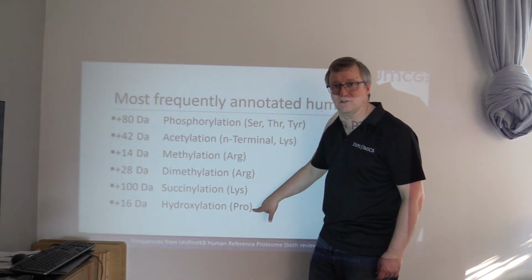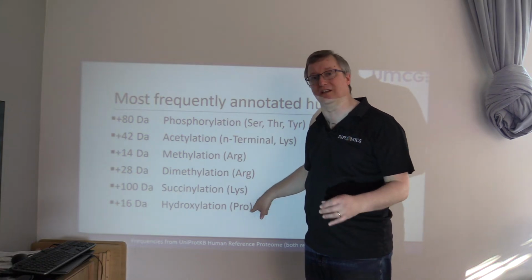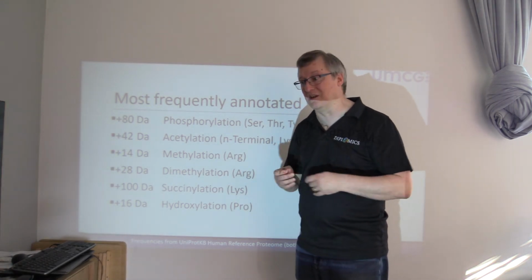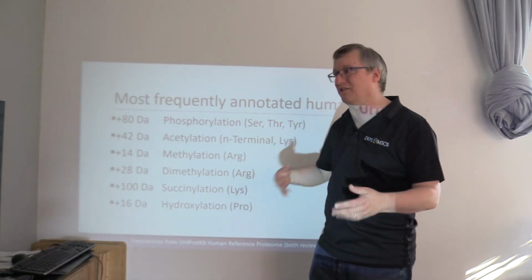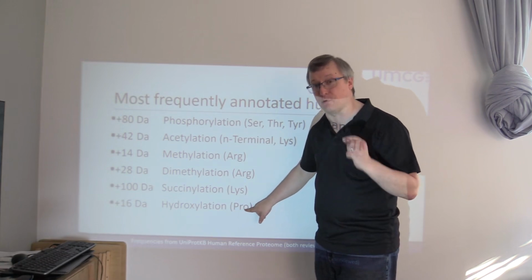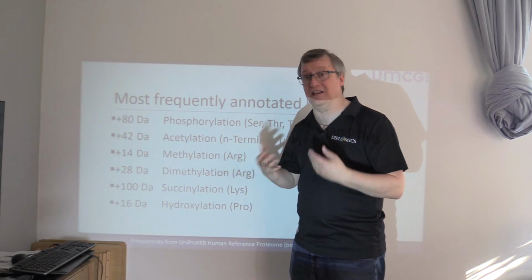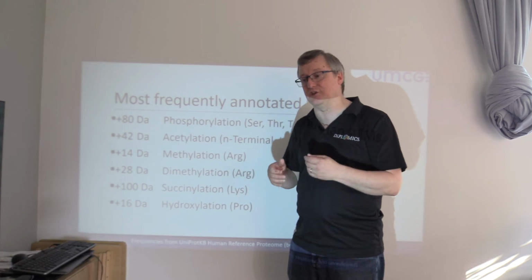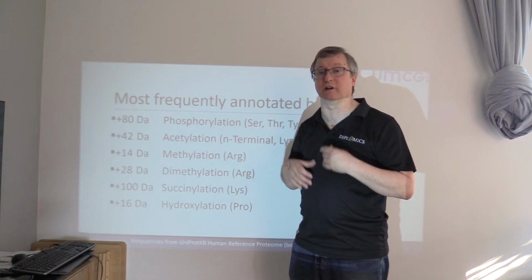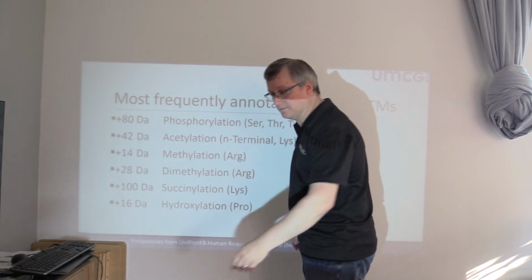And hydroxylation shows up very frequently. And in this case, the hydroxylation is not something we're talking about on methionine. That's not an in vivo modification. Methionine oxidation happens because you breathe near your samples, right? And the oxygen in the air is reacting with them. So hydroxylation of proline is an altogether different thing. Hydroxylation of proline is quite important because in collagen, in solid tissue samples, the collagens have a fair number of prolines, and those prolines are frequently hydroxylated to create hydroxyproline. So that's been documented many times over in the database.